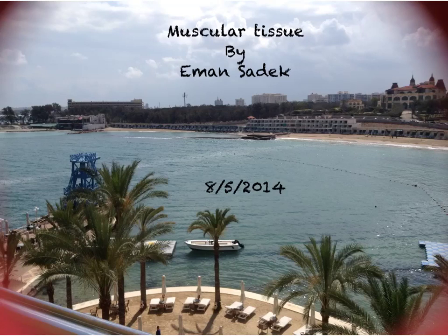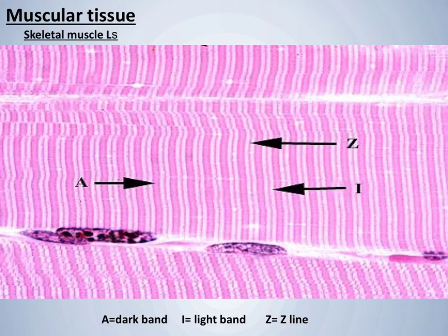Bismillah ar-Rahman ar-Rahim. Today we will describe the muscular tissue slides. In this picture we can see the longitudinal section of the skeletal muscle.